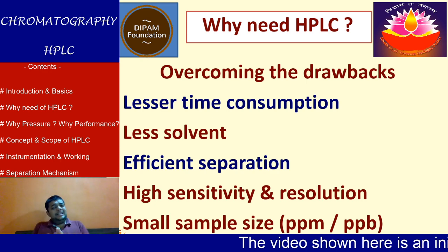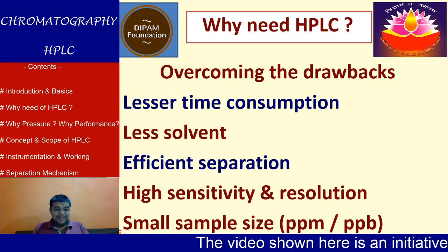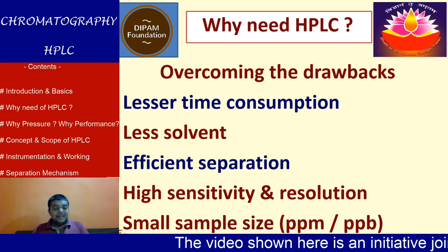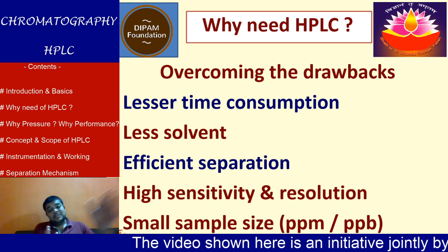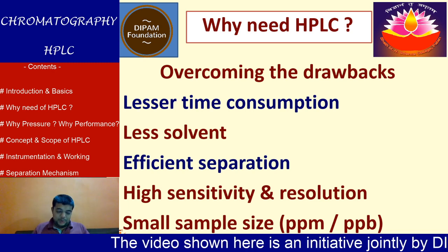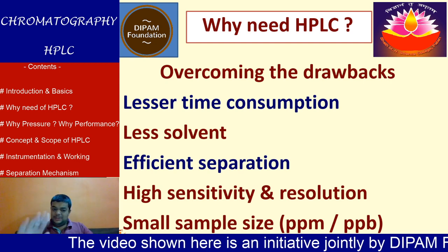Hence, HPLC was a technique. I am using the term "was a technique" because now we are at UPLC. But HPLC is that thing which was needed to overcome these old techniques. So, lesser time consumption, less solvent, efficient separation.